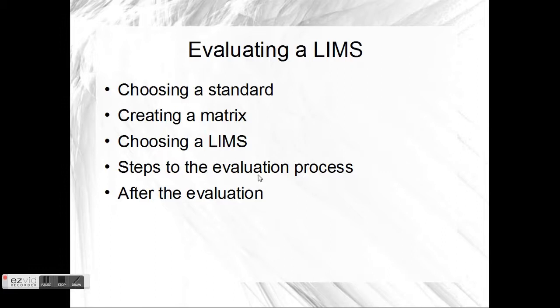Steps to the evaluation process, again, choosing the LIMS is the third step, and then there's actually going through and playing with it, and then there's the after the evaluation. And these are things that we'll discuss later. And the reason I say playing with it is because I like to play with the software. That's how I feel about it.